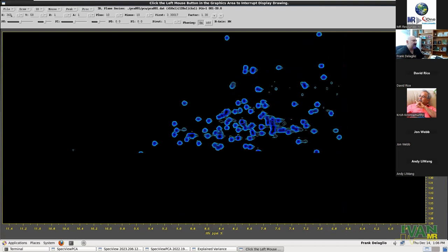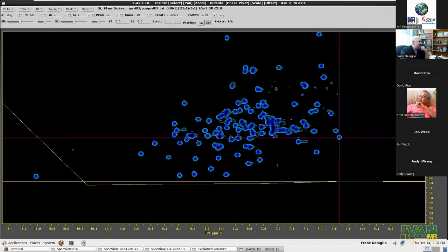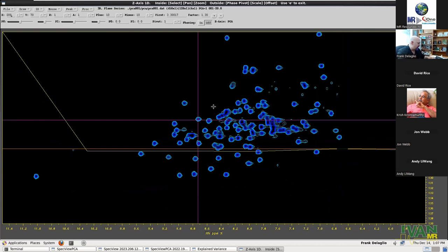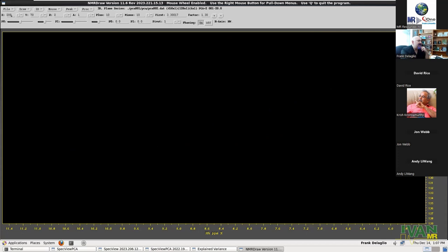So, for example, the PCA is telling us that this peak has different relaxation behavior than some of the other ones. And here, let's look at this. So that's why, look at this. It actually went negative. So that's obviously an artifact. Oh, I'm sorry, these are not the evolutions. This is the PCA spectrum. Silly me. But anyway, so this is a valuable thing about PCA. It quickly allows us to identify parts of the spectra that are behaving differently from the other parts of the spectrum.